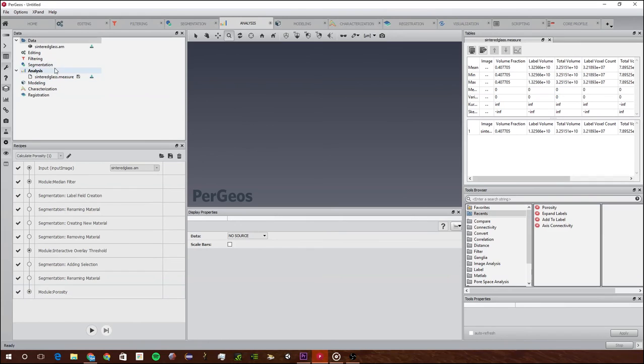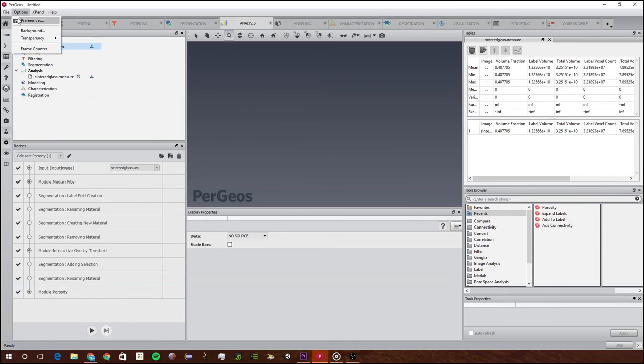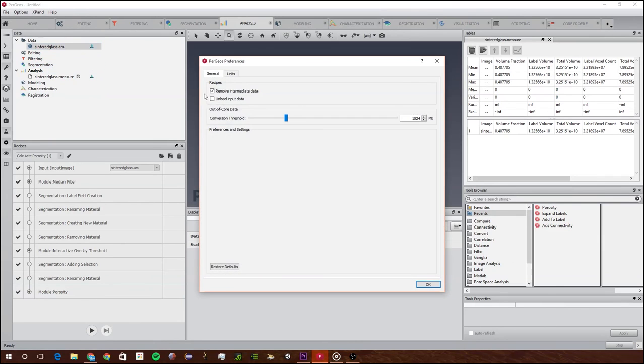If you wanted it to show you each of these steps and give you each of the data after filtering, after segmentation, you can go to options, preferences, and you can click recipes remove intermediate data or not.